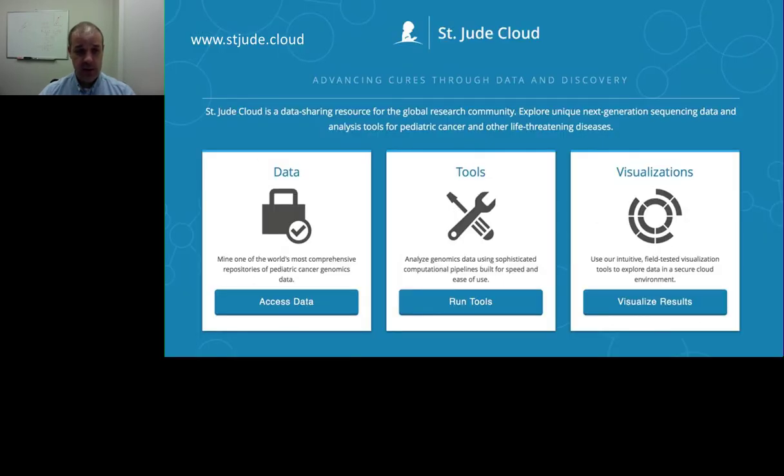So what does it look like? Here is the St. Jude Cloud, www.stjude.cloud. Hopefully that web address is easy to remember. The website is split into 3 sections: data, tools, and visualizations. I'm a scientist. I'm a self-taught programmer. So really what I want to do is get my hands on the data, run some sort of analysis tool on it, and look at the output. I think many of us in the bioinformatics and computational biology field can relate to that workflow.